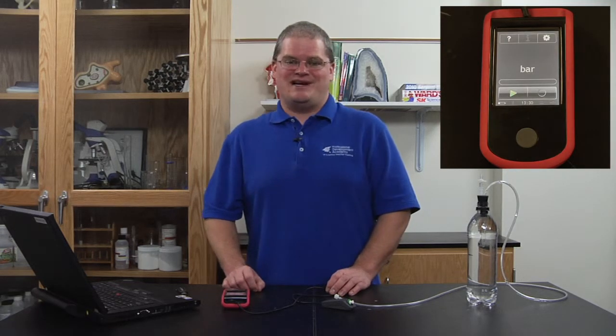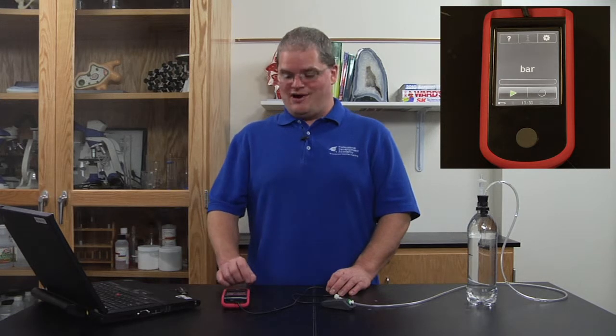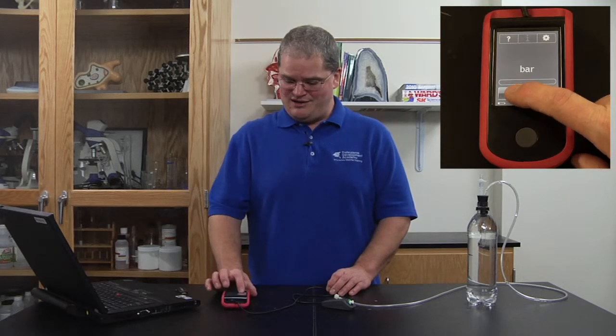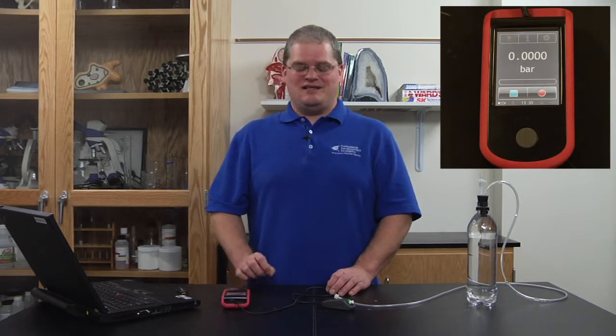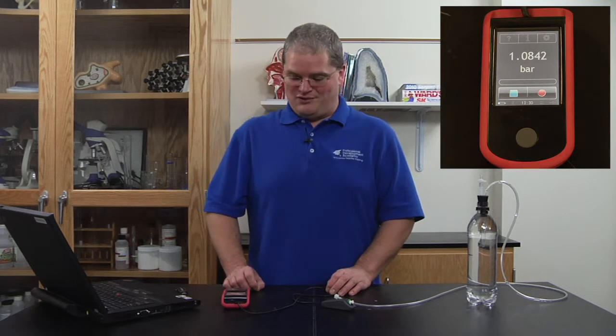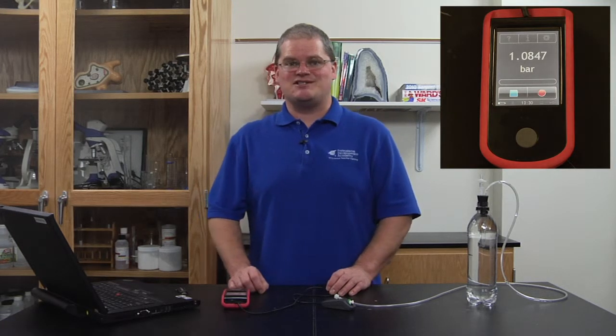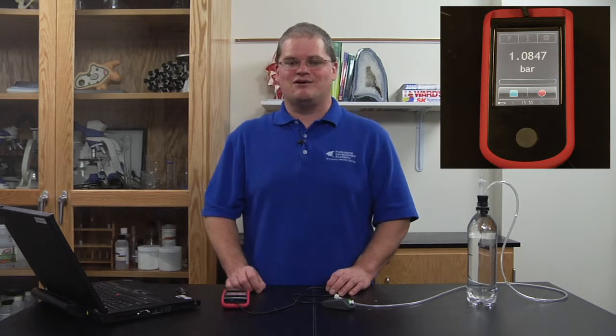In order to begin measuring data, you want to push the green button on the home screen and you'll immediately begin to measure the gas pressure of the room. Currently you can see the gas pressure in the room is 1.08 bars.